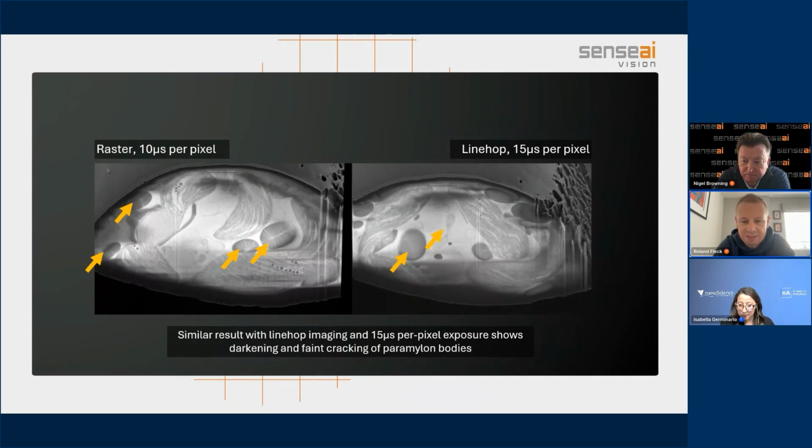With the tests we did with the team in Liverpool on the academic side, for biological tissue, it seems that the lower threshold is about 10%, from 100 down to 10%. When they compare a 100% image to a 10% image, there's basically no difference. 12.5%, 25%, they're essentially identical. When you start going below 10%, the samples just aren't sparse enough for the dictionary learning to work effectively. Now, I have been told if you spend enough time, it will work.